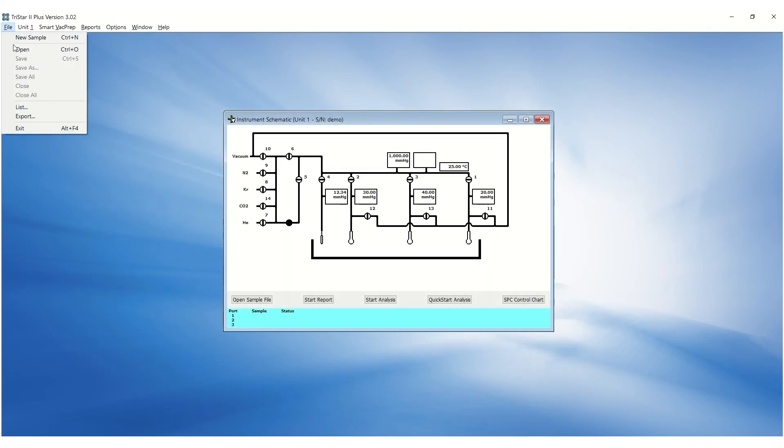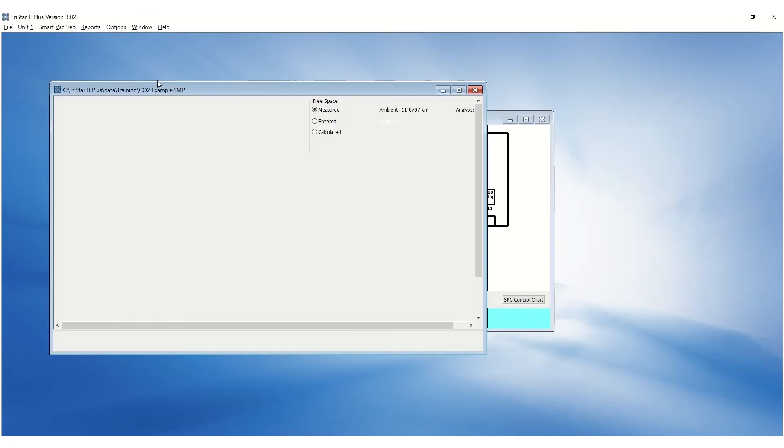Once the analysis is complete, go to File, Open, and open the sample file.